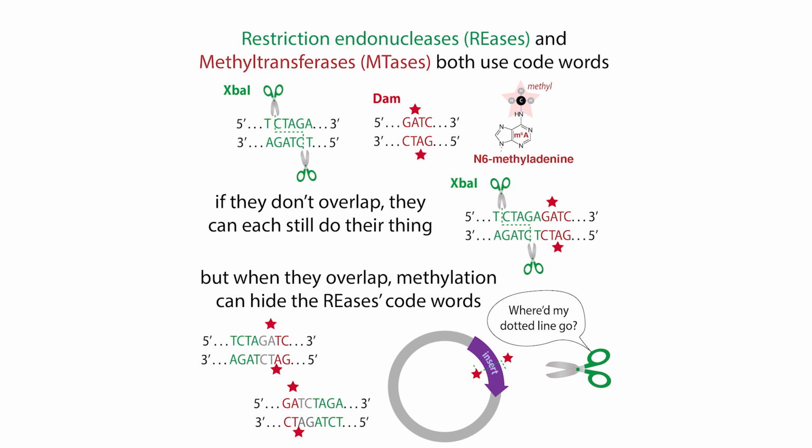The exact detail of this RM system, the restriction modification system, differs in different bacteria. Sometimes they have the methyltransferase attached to a restriction enzyme, and sometimes they're separate. The systems that have them separate are mostly useful for us because we can use the restriction enzyme part.